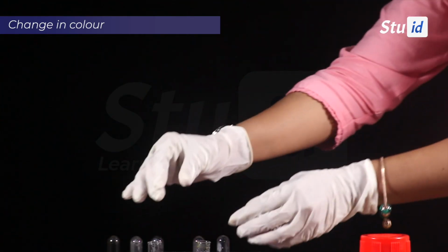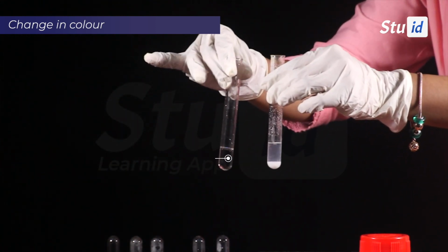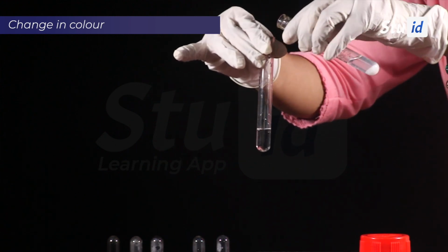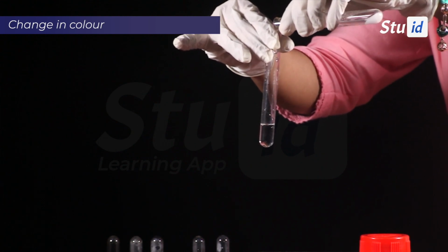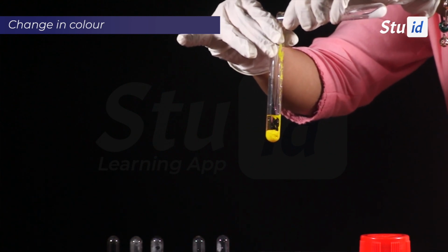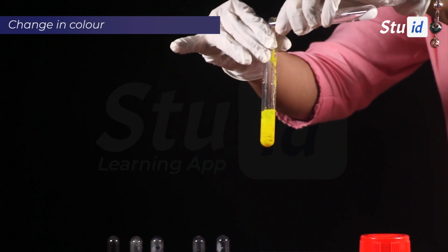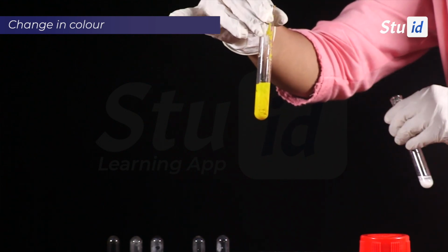Alright, for this what we need is, we will take two test tubes, one containing potassium iodide and the other with lead nitrate. Alright, when we mix them together, just start pouring lead nitrate into the potassium iodide solution. As soon as it starts combining, we can see a yellow precipitate suddenly formed. Why is this happening? The color is due to the presence of lead iodide forming in the solution, which will later on precipitate to the bottom of the test tube.